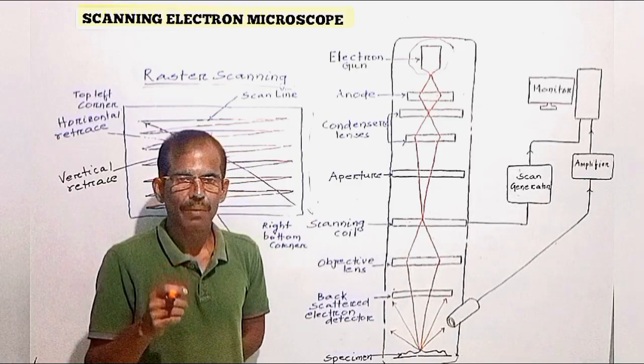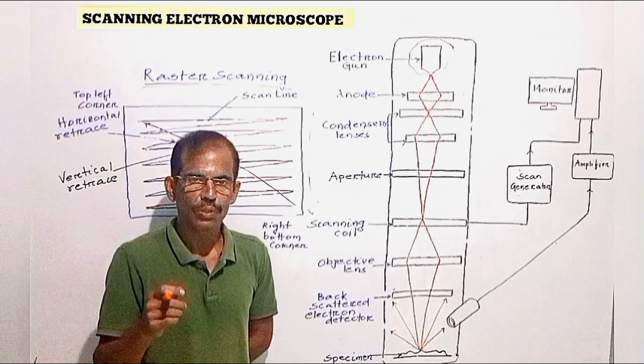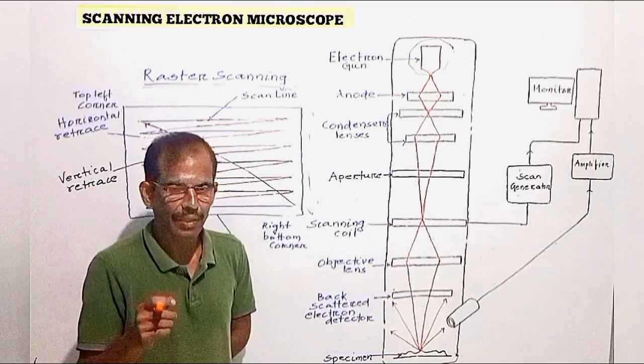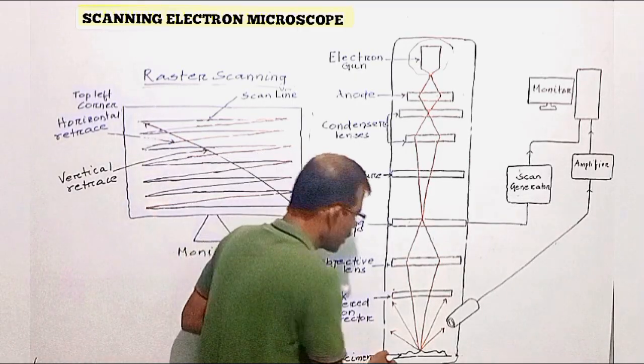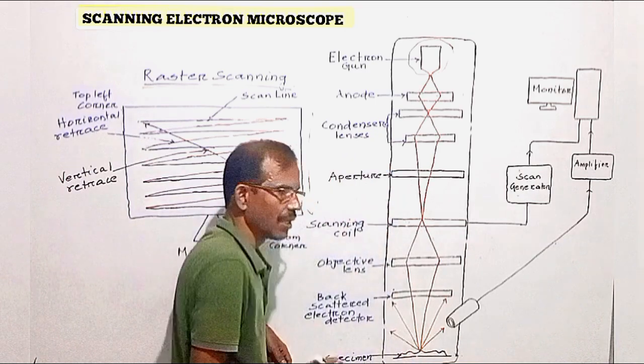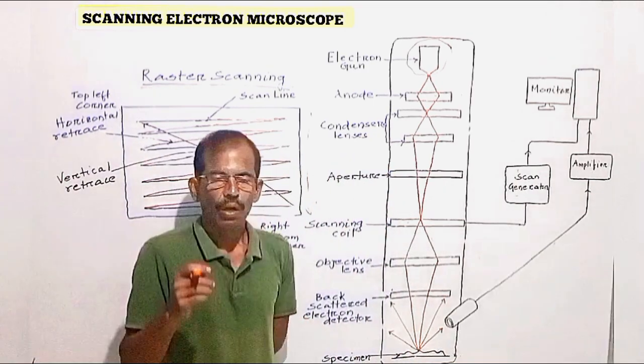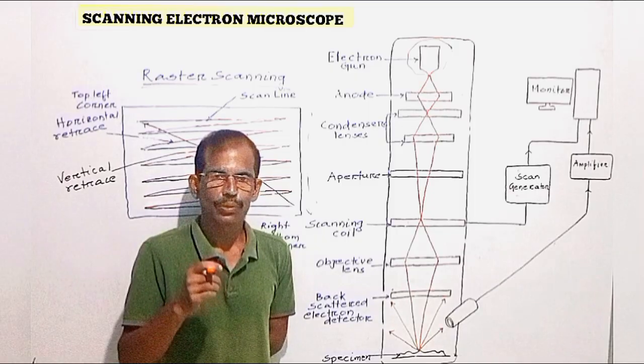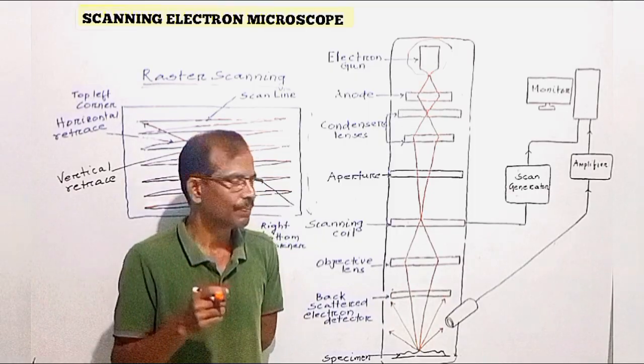The dried sample is then coated with gold to ensure conductivity. After that, the specimen is placed on the support grid for examination. Other types of samples must be prepared according to the procedure prescribed.